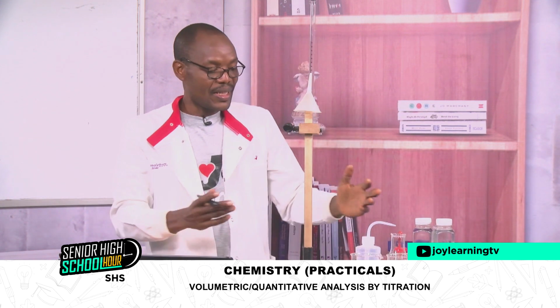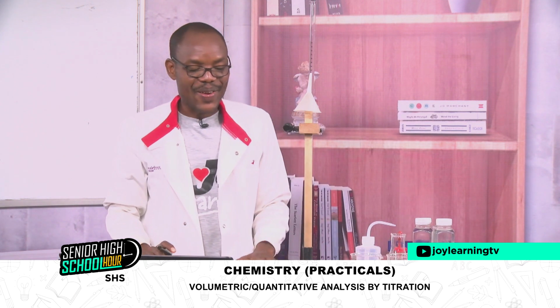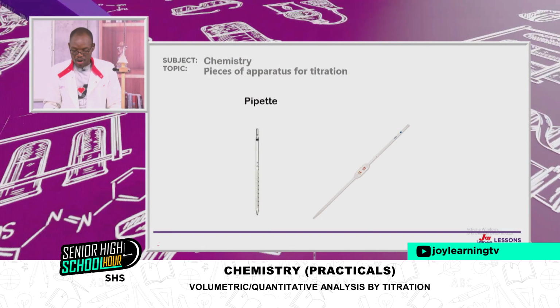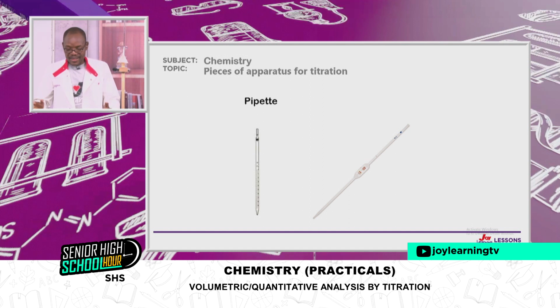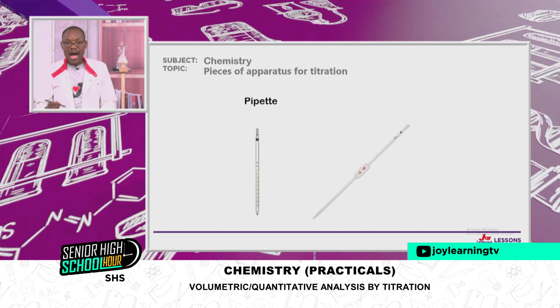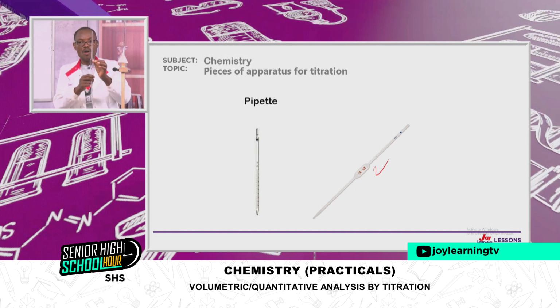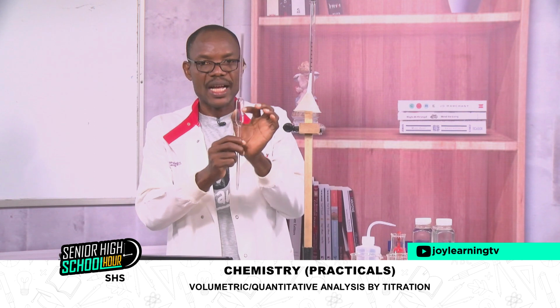We are assembling the apparatus that we need to carry out the volumetric analysis. The next on our list, you can see on your screen, is the pipette. And the pipette comes in various forms. But for our purposes, we want to use this one, the one with the bulb. So this is the bulb pipette. It has a bulb, so that is its name.